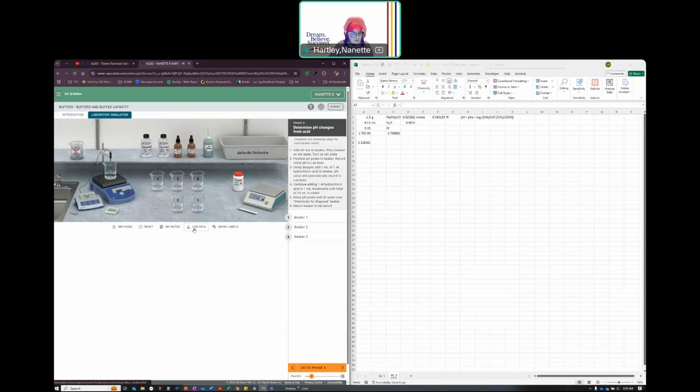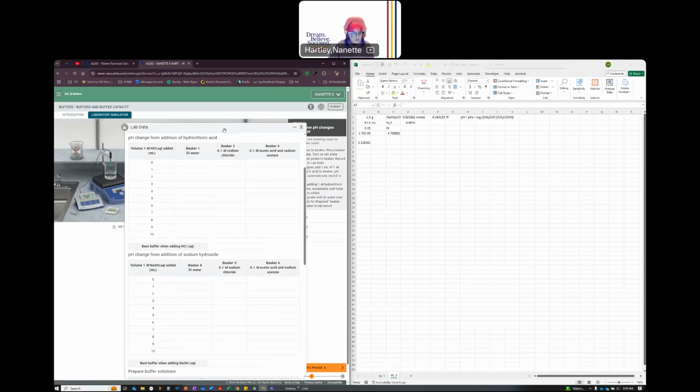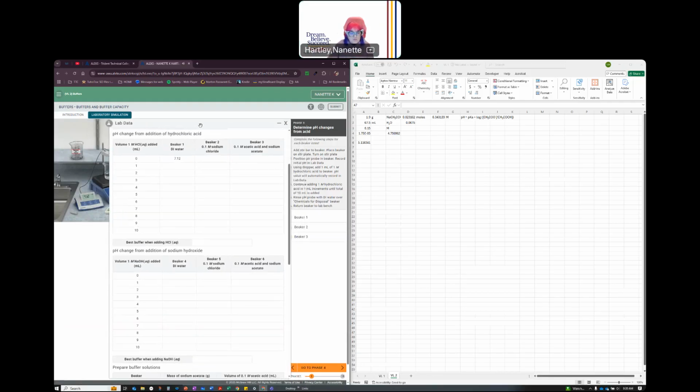Record initial pH. One, two. Using dropper, add 1 milliliter of 1 molar hydrochloric acid.